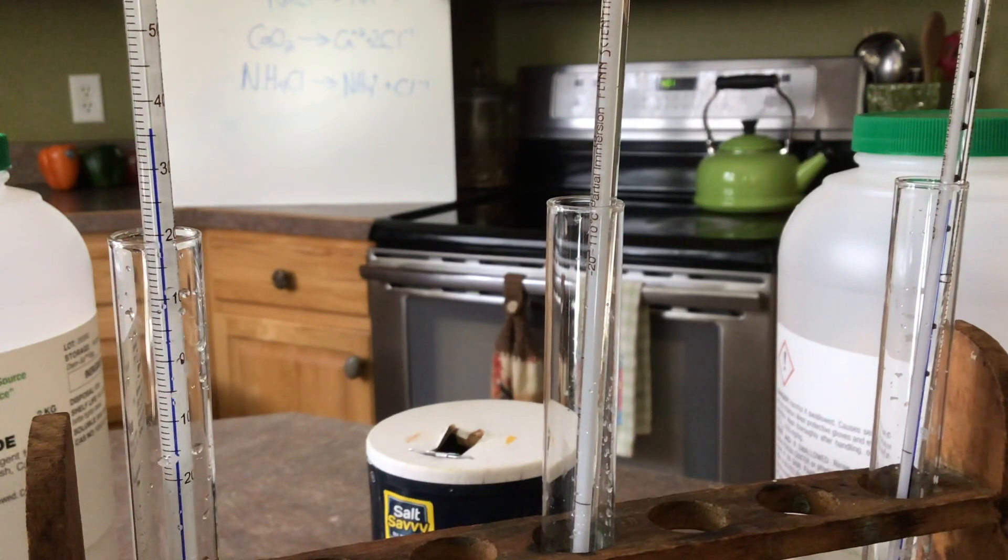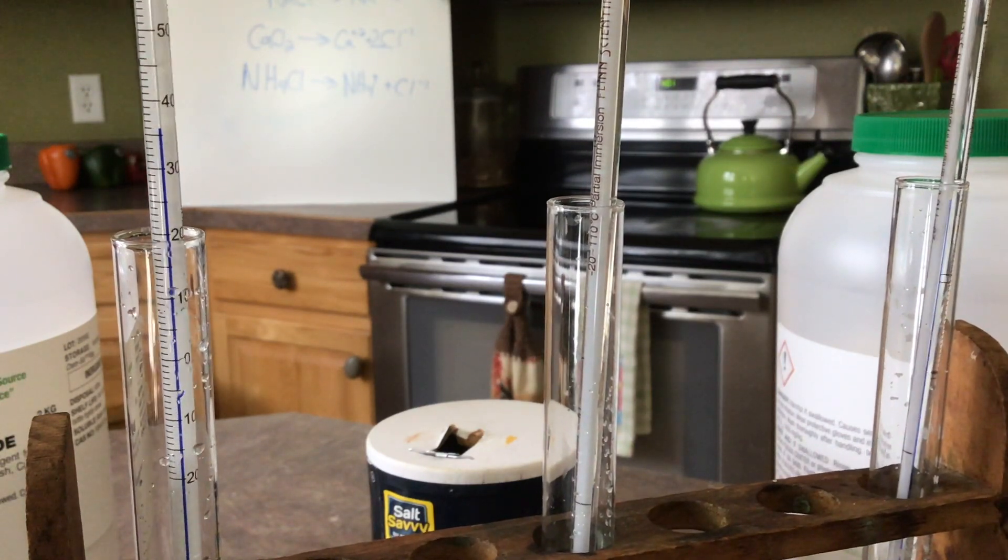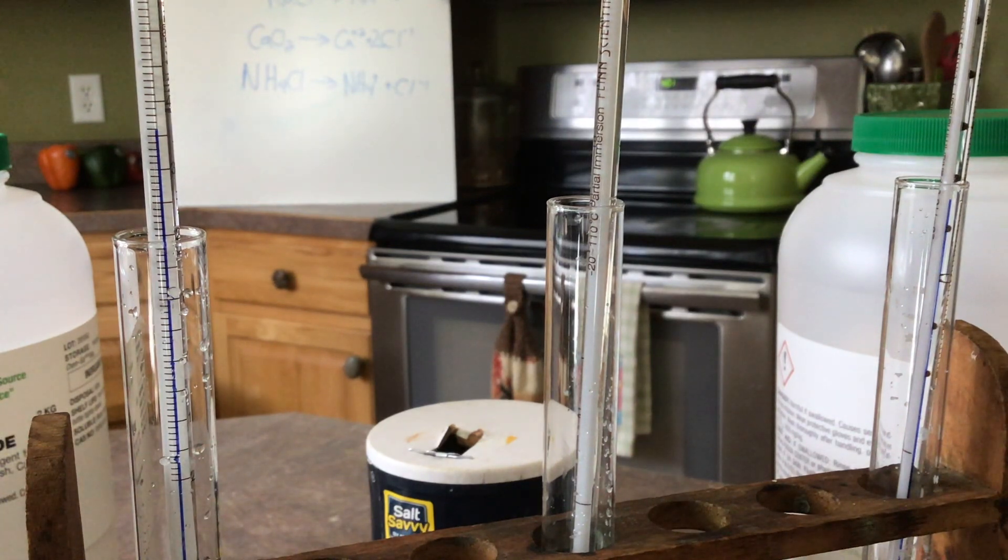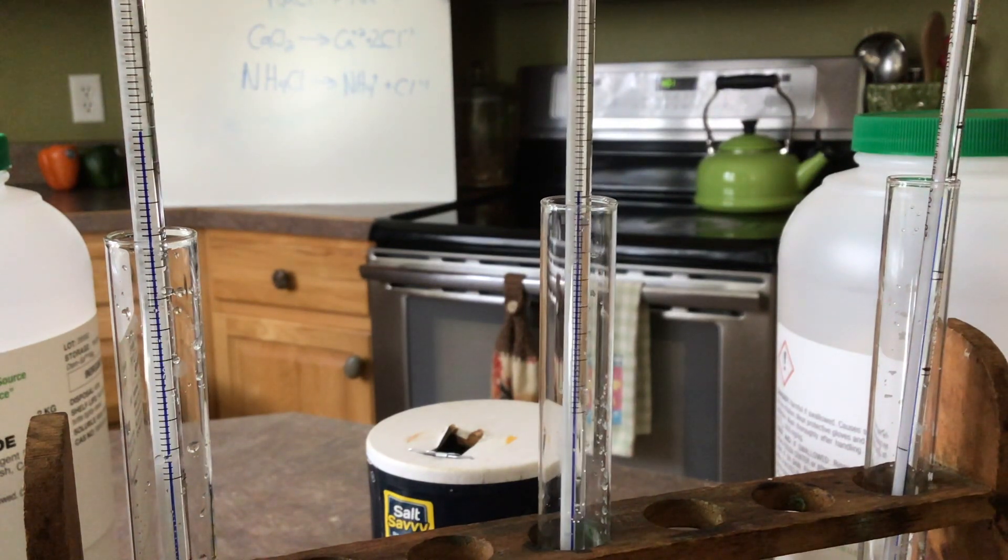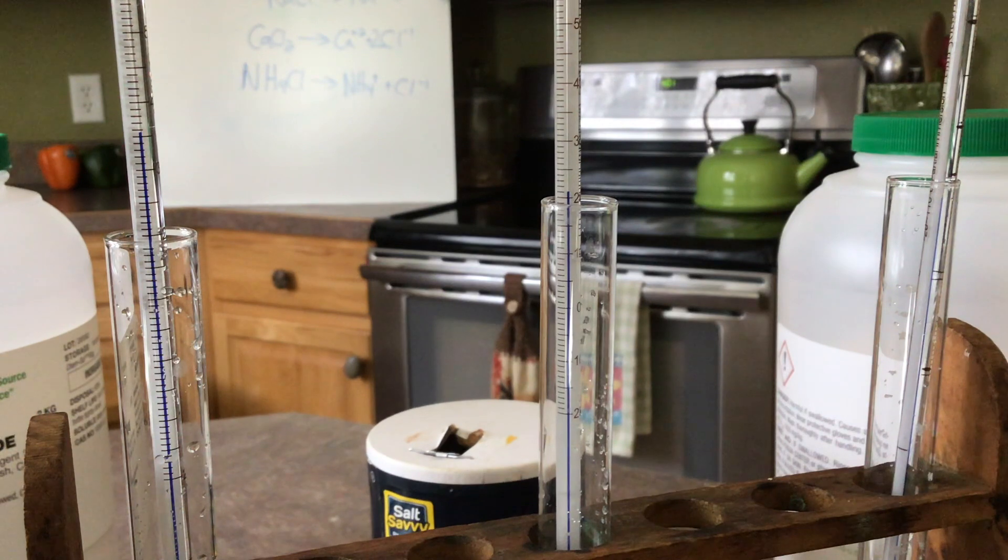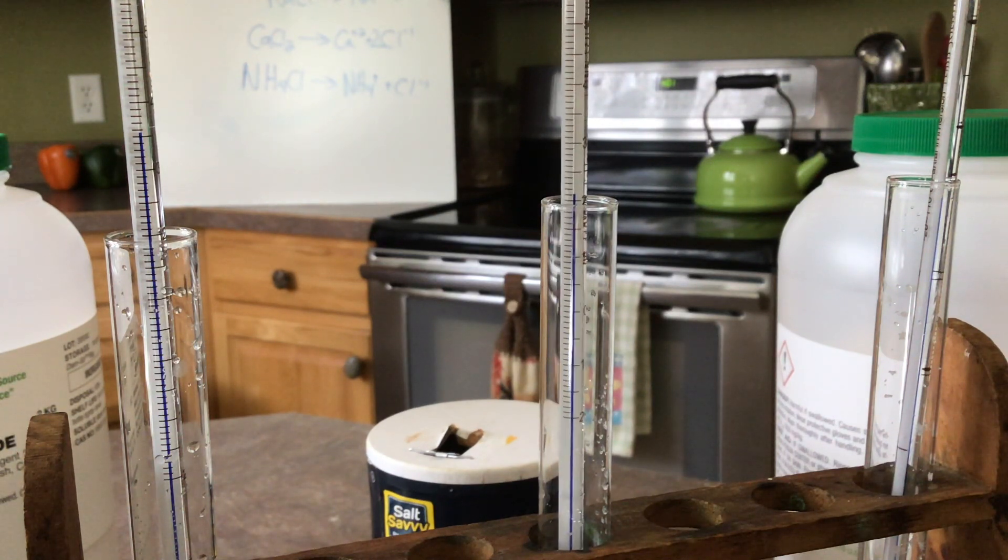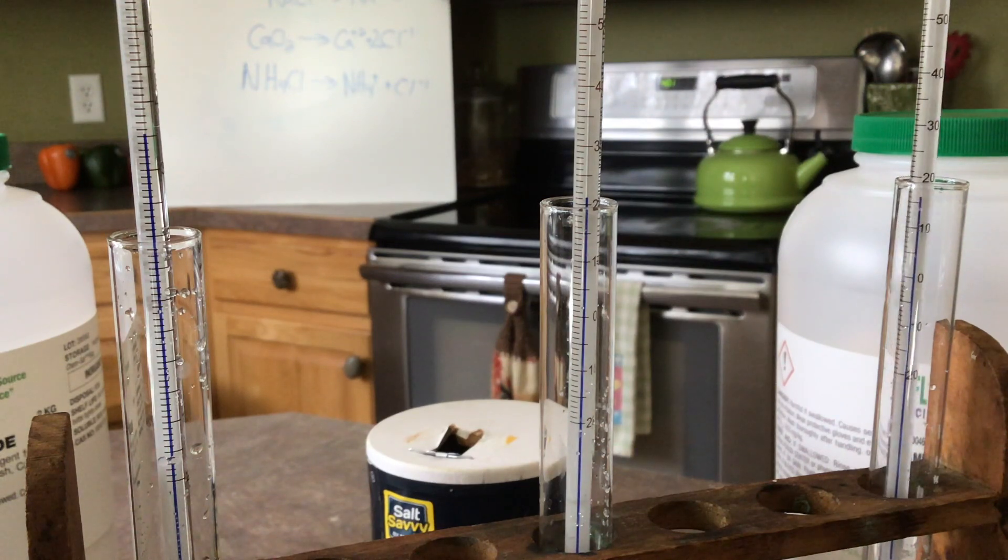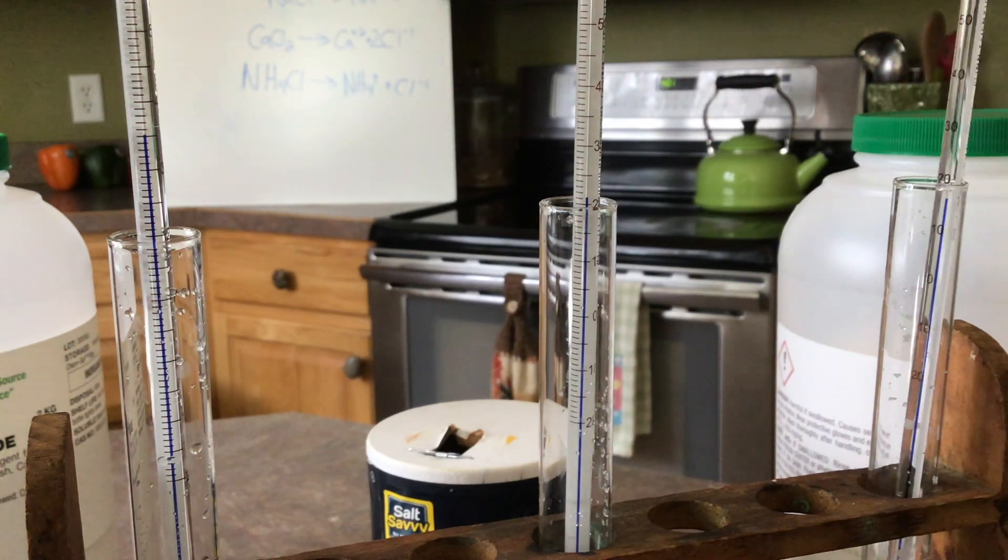Let's go ahead and take a look at those final temperatures. With our calcium chloride, we've gone all the way up to 36.0. For our sodium chloride, it appears as if we are at about 21.0. And for our ammonium chloride, the temperature has decreased down to 16.0.